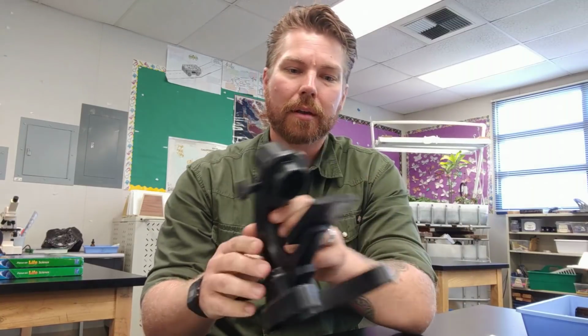Hey everybody, today we're going to be doing this activity right here. It's a cell exploration, and the thing we're going to be using today are microviewers. We've never used these before. They almost look like a microscope, but they're a little bit different. You'll find two of these in each of your trays at your tables.